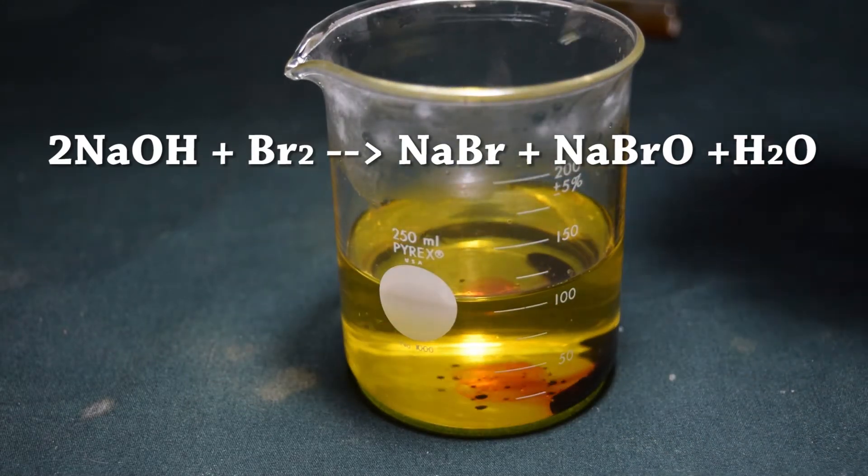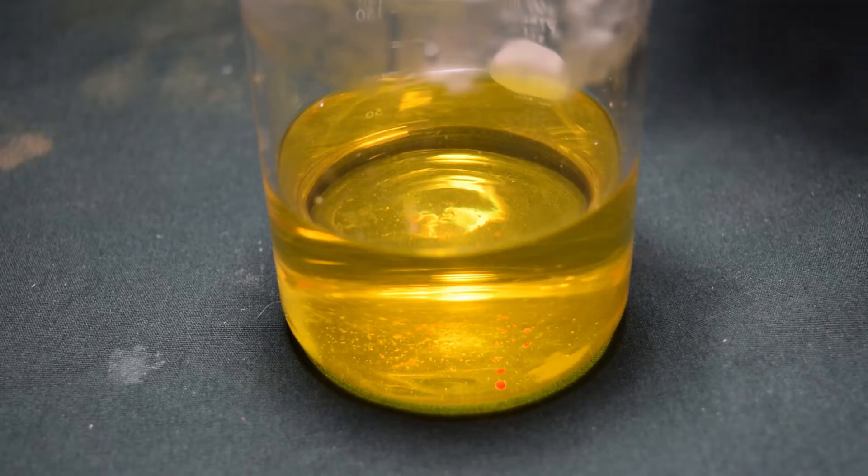It turns a very pale yellow color. This is sodium hypobromite solution. Let's test its bleaching power.